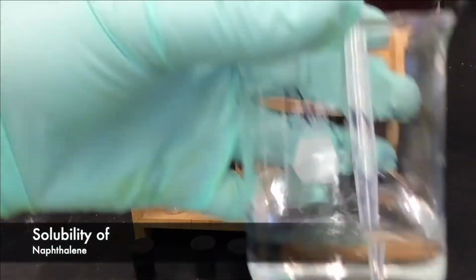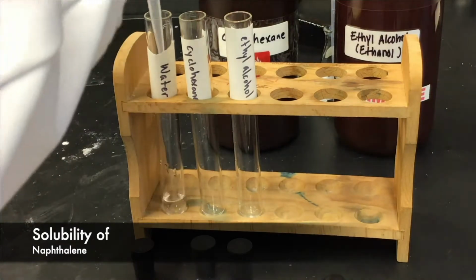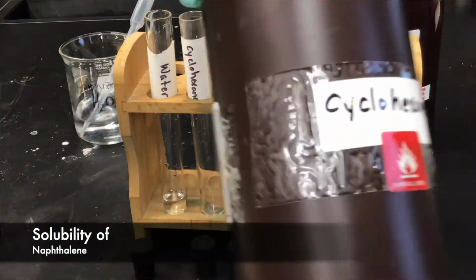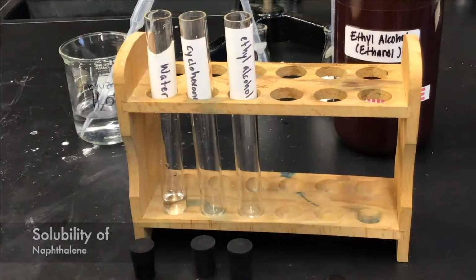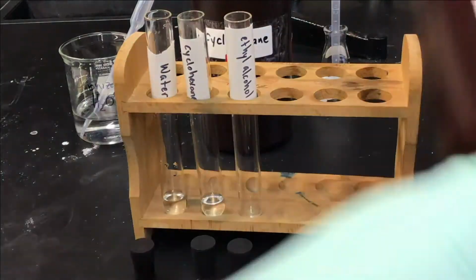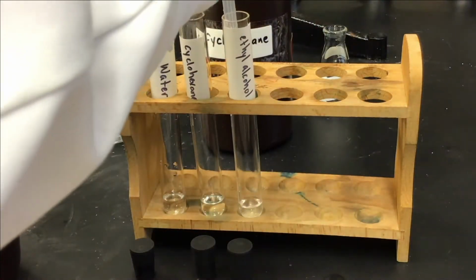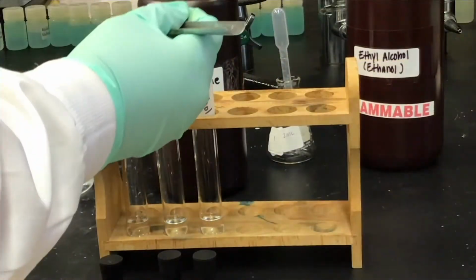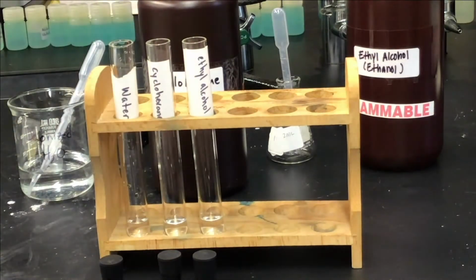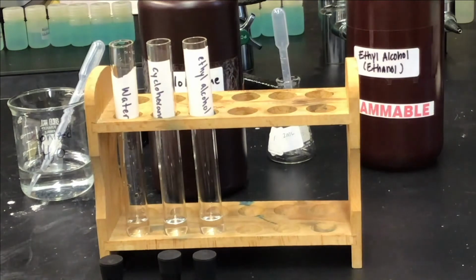First, we're going to put 2 to 3 milliliters of DI water in one test tube, 2 to 3 milliliters of cyclohexane in another test tube, and 2 to 3 milliliters of ethyl alcohol in our third test tube. Once all our liquids are in the proper labeled test tube, we're going to put a few small crystals of our naphthalene in each one.